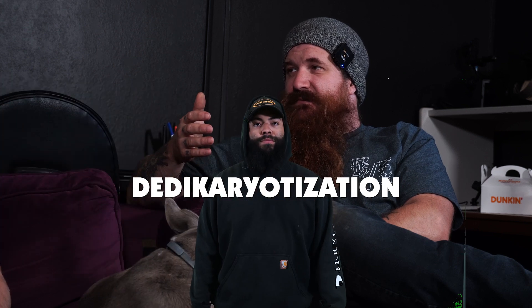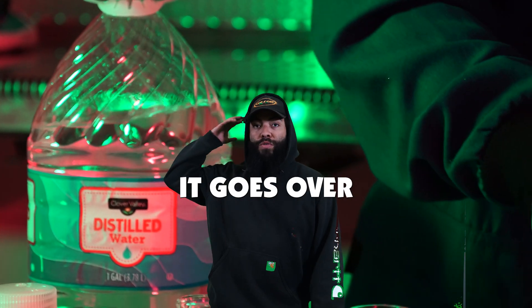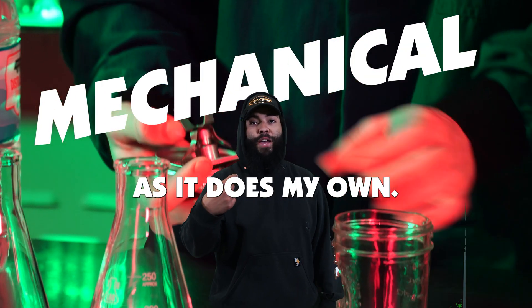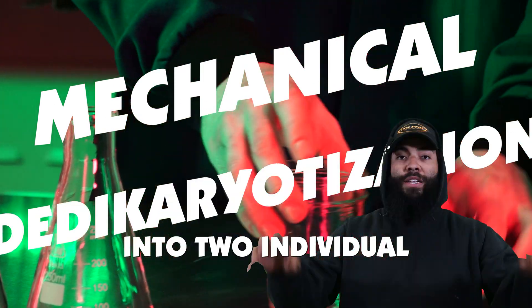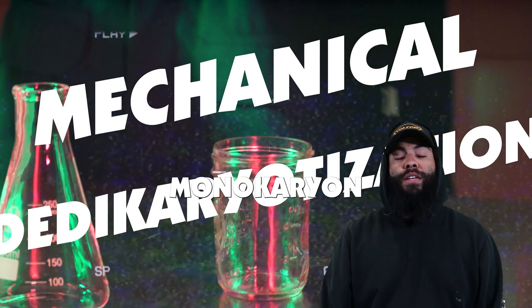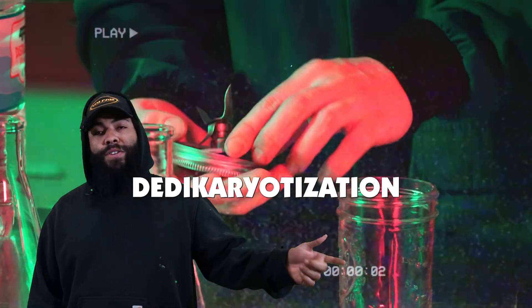Dedikaryotization. When I say that, it goes over most people's heads, as it does my own. It's the process by which you split a dikaryon into two individual monokaryons — mechanical dedikaryotization.